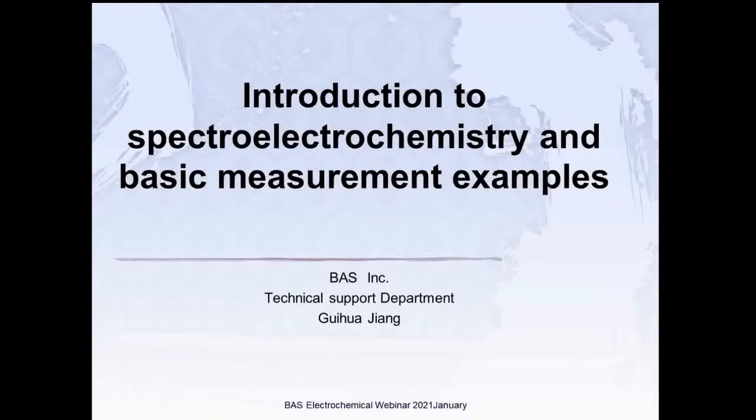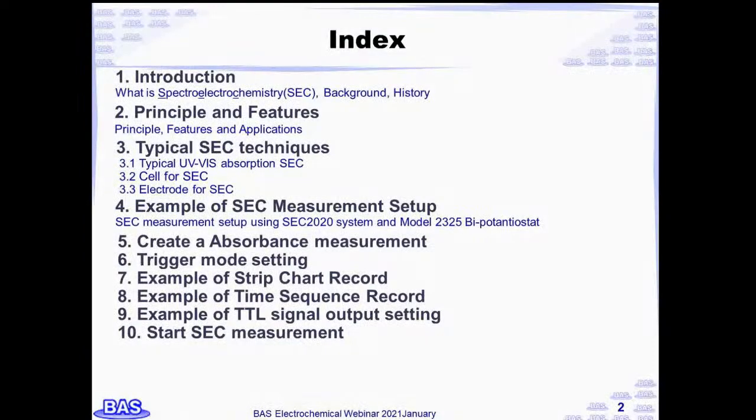Let me show you the contents we will talk about. At first, I'd like to explain what spectroelectrochemistry is, its background and history. Second, the principle, features, and application of spectroelectrochemistry. And then I will show you the typical SEC techniques, including ultraviolet visible absorption SEC, cell, and electrode.